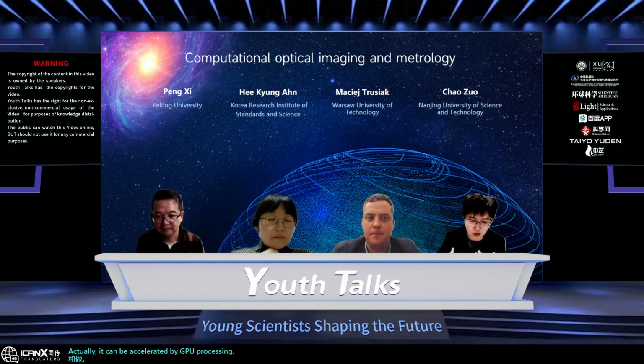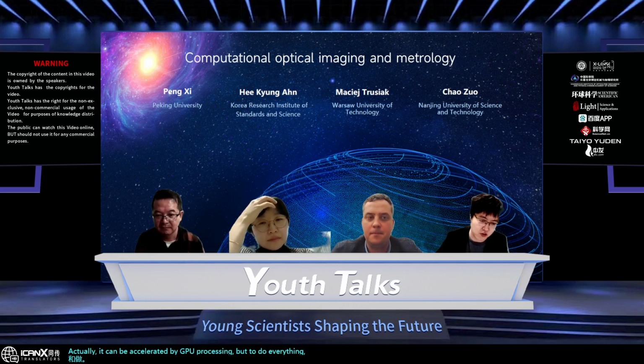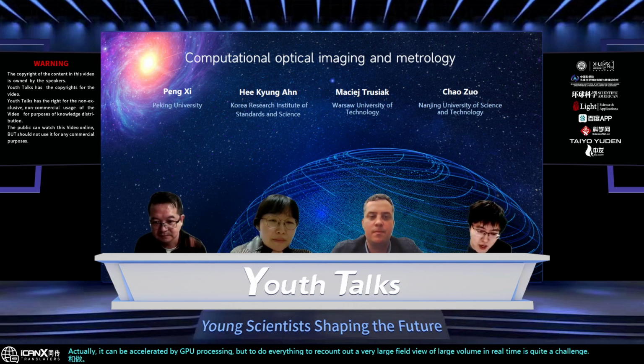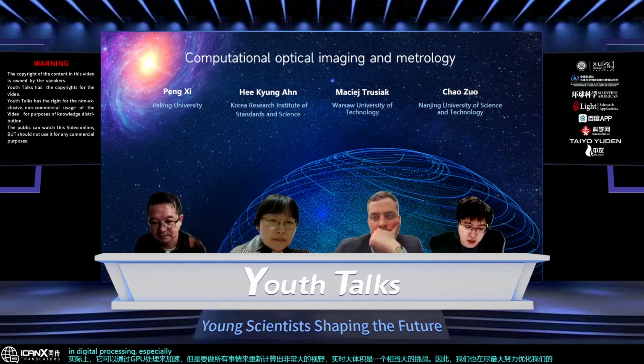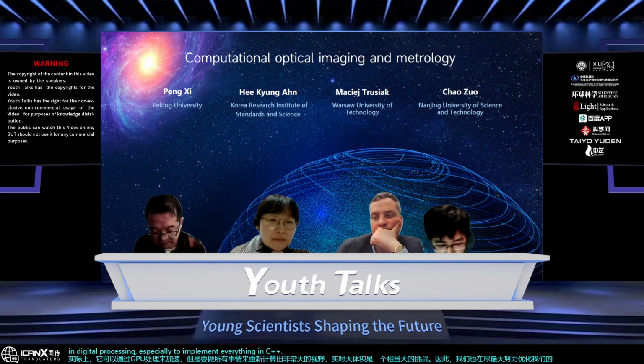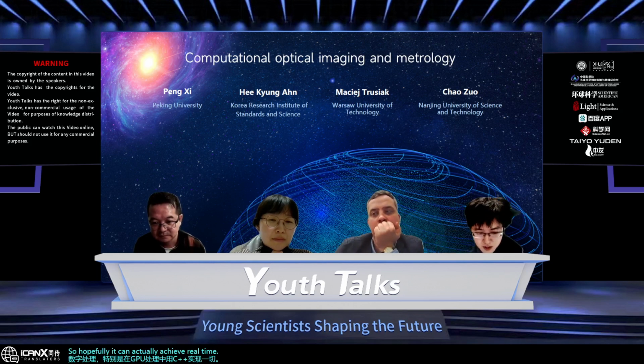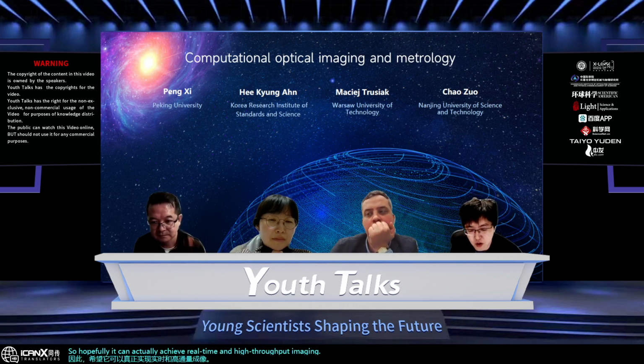But to reconstruct a very large field of view and large volume in real time is quite a challenge. So we are also trying our best to optimize our algorithm and digital processing, especially to implement everything in C++ on GPU in parallel. So hopefully it can achieve real-time, high throughput imaging, either for ptychography microscopy or for lens-free microscopy. It's possible, but currently it's quite challenging.